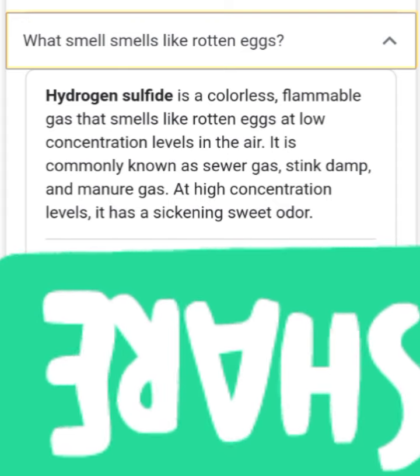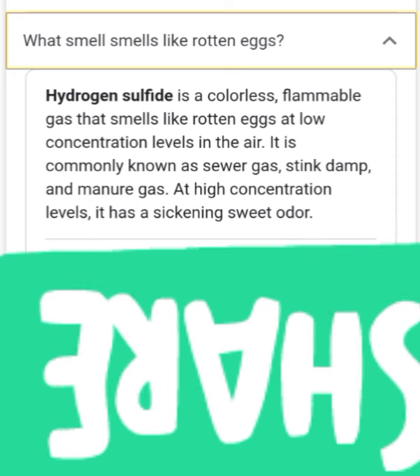If you are doing salt analysis and you see a colorless flammable gas leaving your experiment and having a rotten egg smell, you can say, okay, it's hydrogen sulfide, even though you have not tested it yet. If you have these physical properties, you say this is probably hydrogen sulfide before you make your confirmation. So all these are used in salt analysis to confirm some salts in solutions.